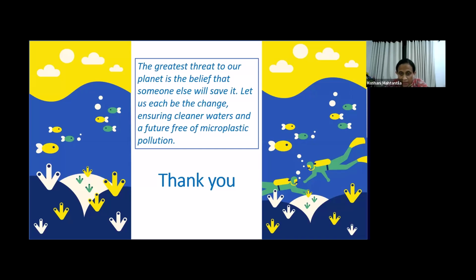But for the spectroscopic analysis, as we are counting the number, we cannot use energy to homogenize the samples, because if the sample is broken, it will give false results.